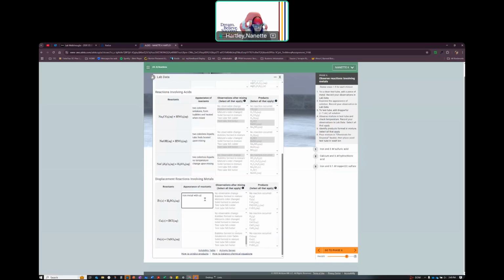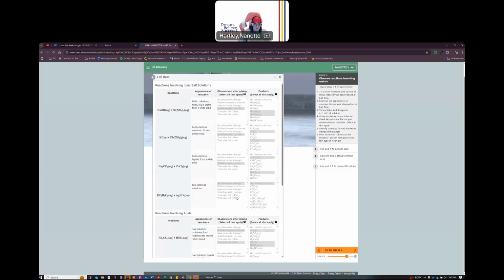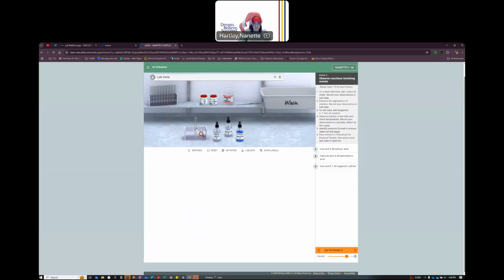Heated. Bubbles. Hotter. H2 and made FeSO4. Okay, now we're going to put the calcium back in.